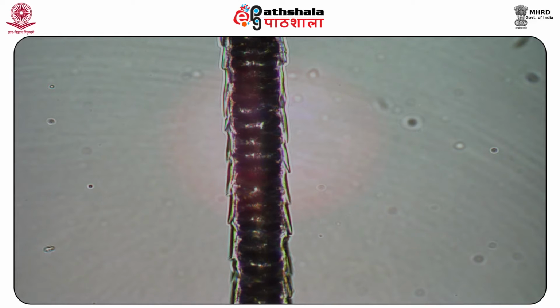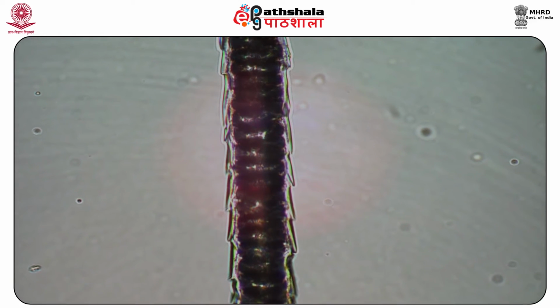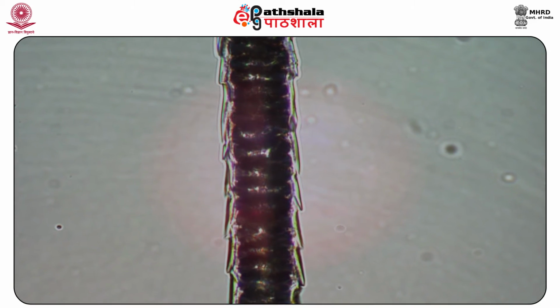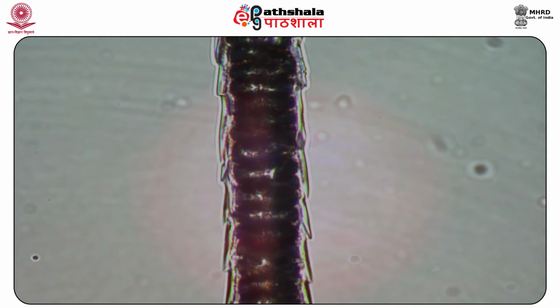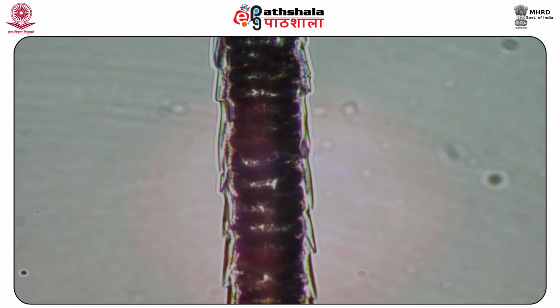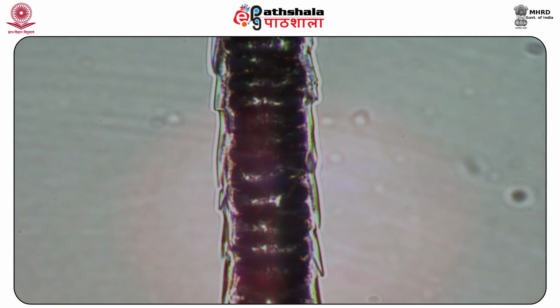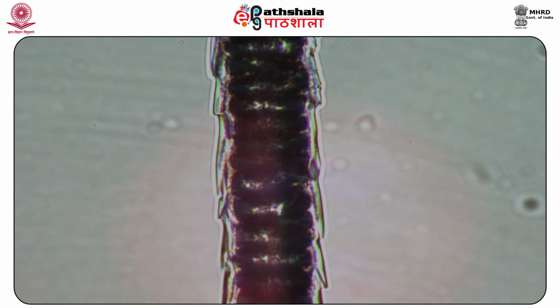The presence of a small amount of debris or blood on hair may not interfere with the microscopic examination. Cleaned and washed hair should be dried before mounting it. Hair samples which show thermal or mechanical damage may be more brittle and should be handled carefully.